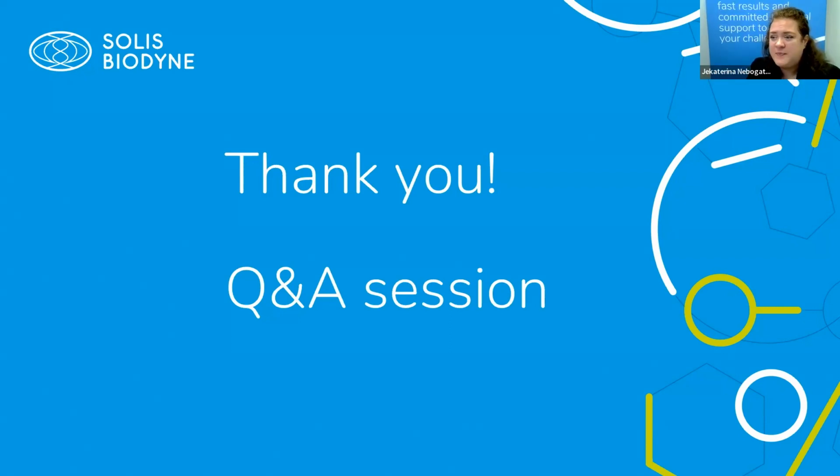Thank you, Robin, for your question. Yes, if you use ready-to-load mixes, it can affect sequencing results, but we have mixes without dye. So for every application, you choose wisely, think through what your post-PCR analysis is, and if you do not require visualization on a gel, just use mixes without dye. Exactly, and there's plenty to choose from in our portfolio.